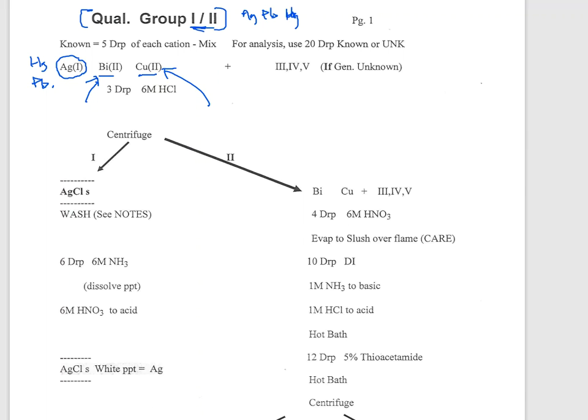So here's how I want you to understand what you're getting ready to do. You have a beaker or a sample of solution. That solution could have multiple positives in it. It is cation alphabet soup. That's what this is. And it's our job to figure out what's in the alphabet soup. What is present? What is there? What is missing? That is the whole intention of qualitative analysis.